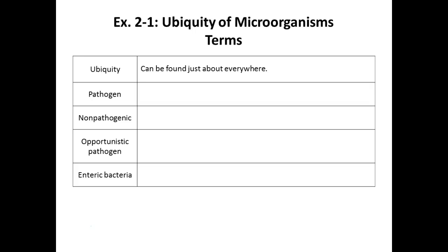Pathogens. What do we think when I say pathogen? Disease, illness, right? And this is an organism that we know causes disease, right? We know will make you sick. Klebsiella pneumoniae. We know it will cause a serious form of pneumonia. Do not lick the petri dish.